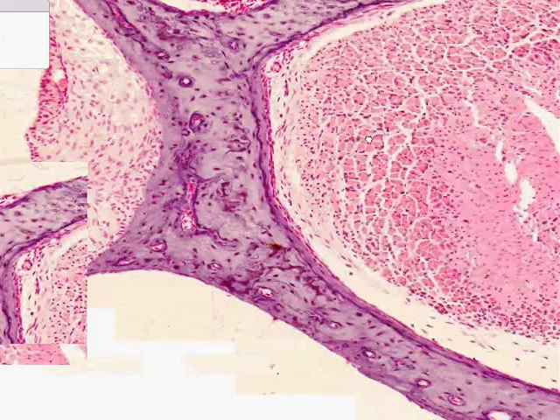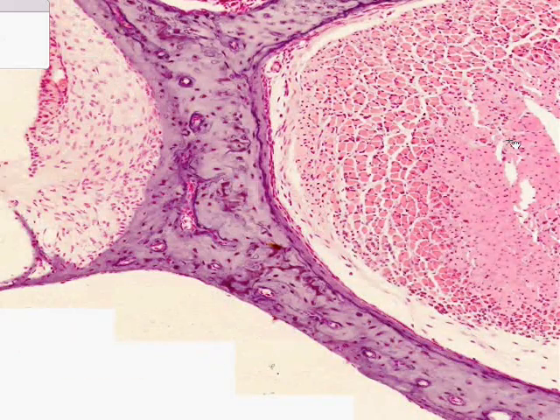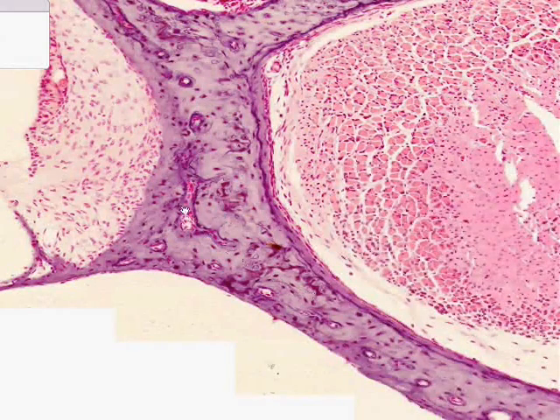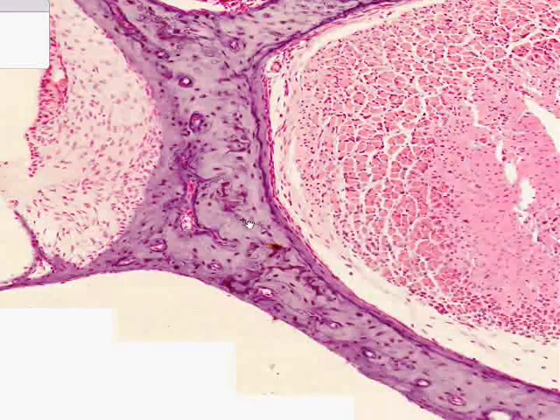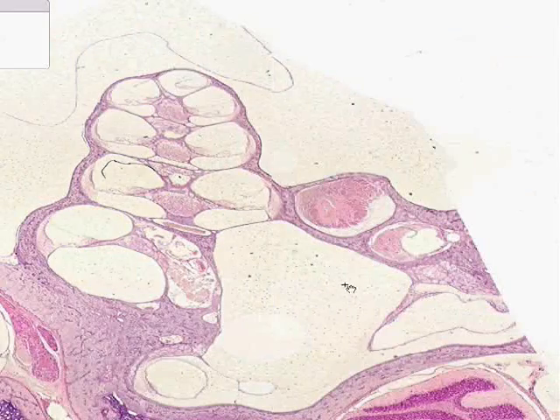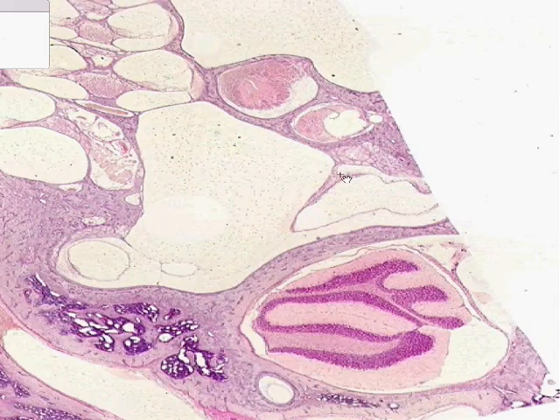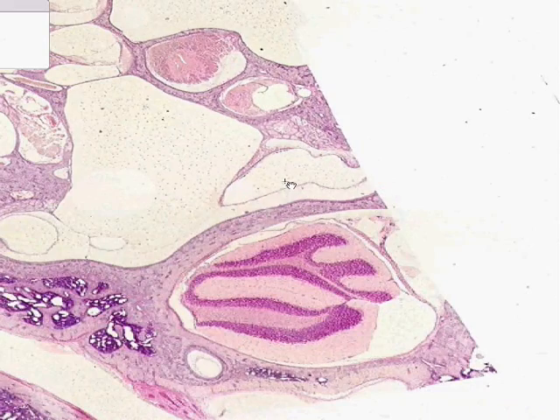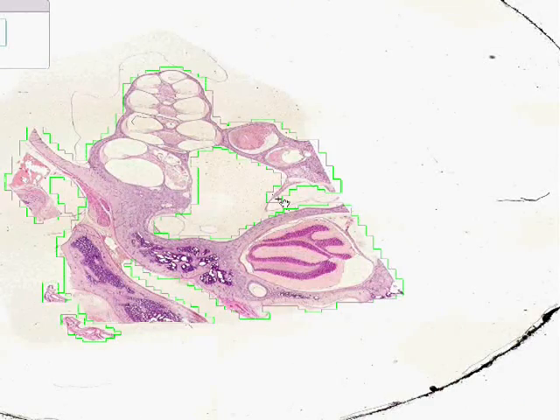We're lucky enough to get it in the same section as the cochlea. This is the vestibule. This is the part of the vestibule that is either the saccule or the utricle, in which the macula are present. The macula are the site of nerve impulses where the sensation of static equilibrium occurs.